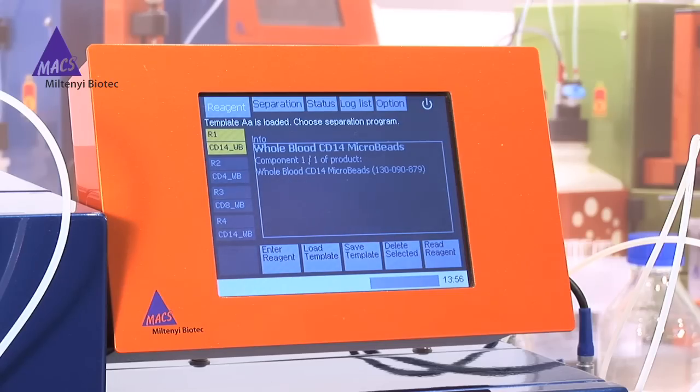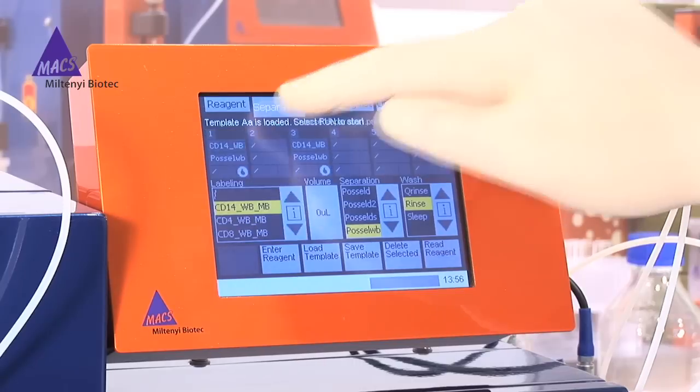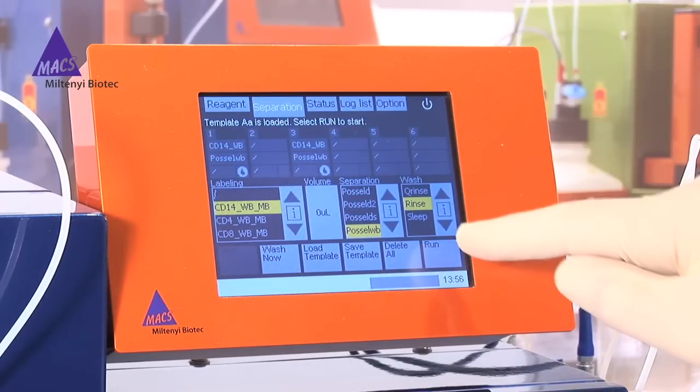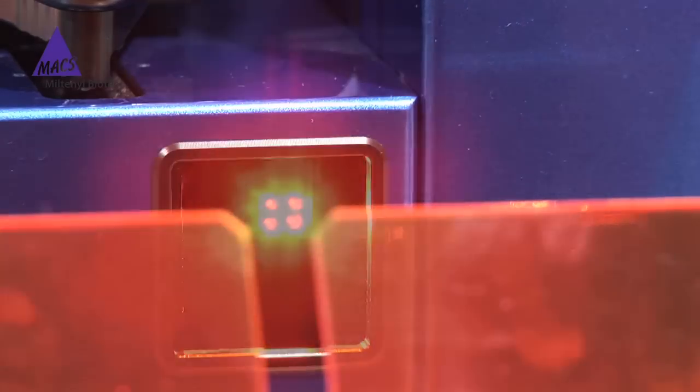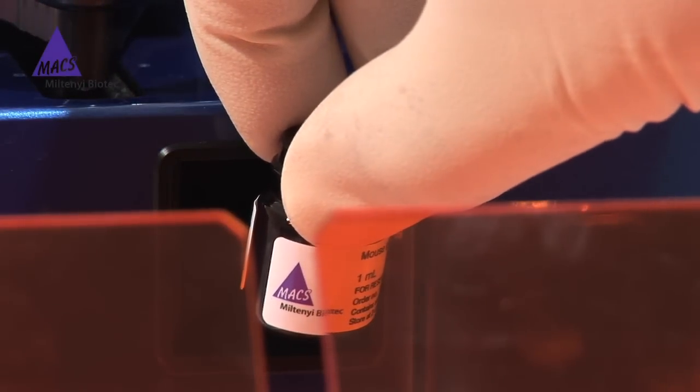In this example, we will isolate CD14 positive cells in three easy steps. First, scan the reagent using the barcode reader on the instrument and place the reagent on the reagent rack.